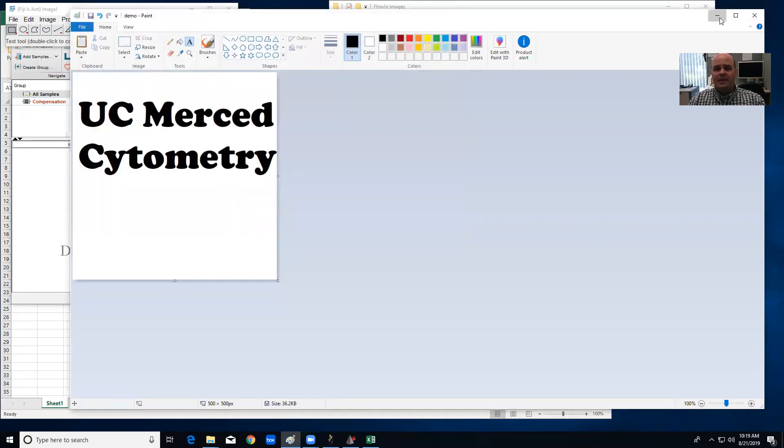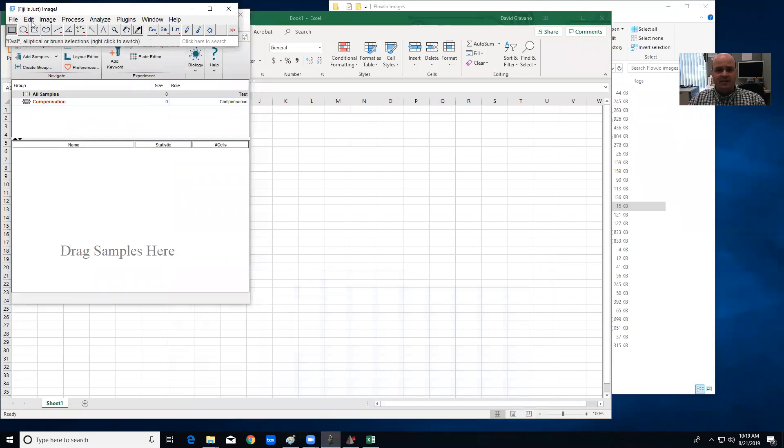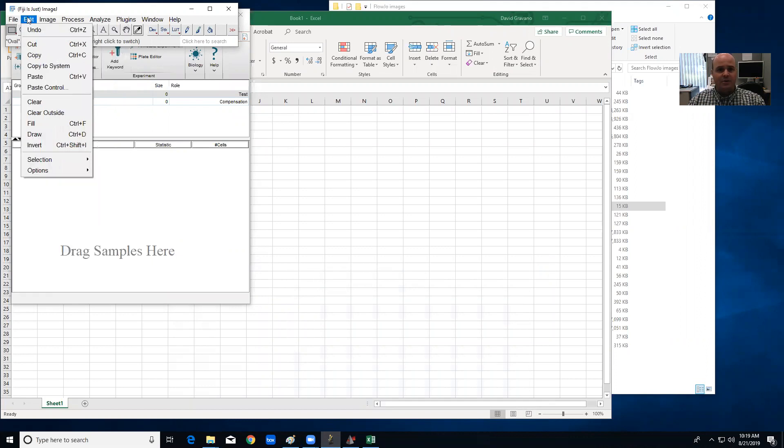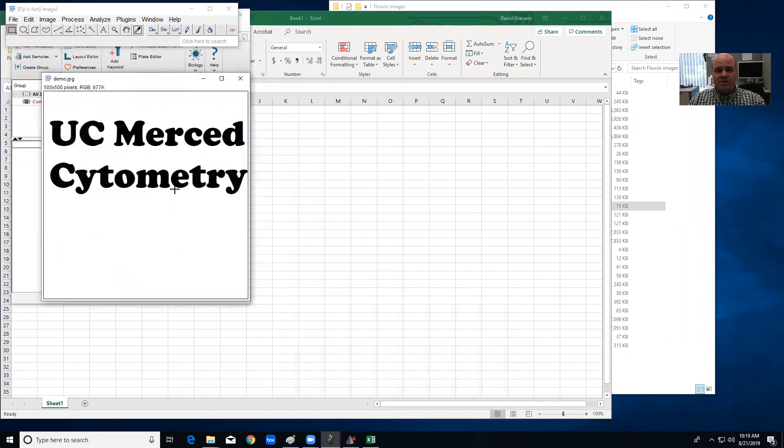Once we're done with that, I'm going to go to ImageJ, and I like ImageJ because you can get the coordinates of that image file. So what we're going to do is we're going to open that file we just created.